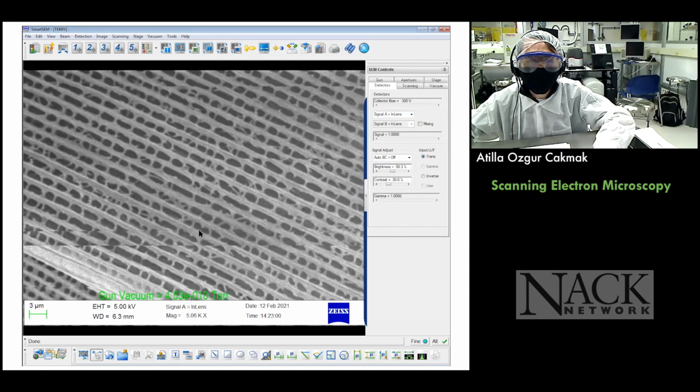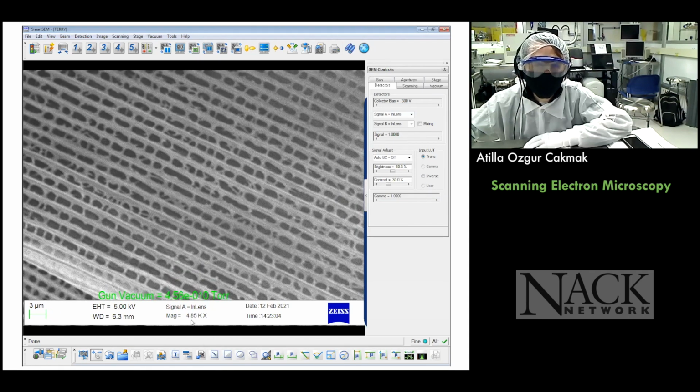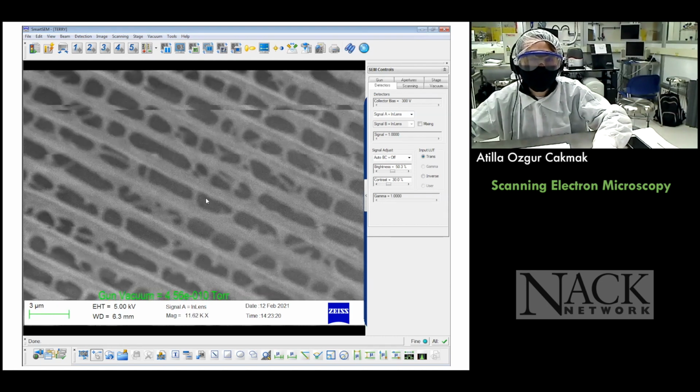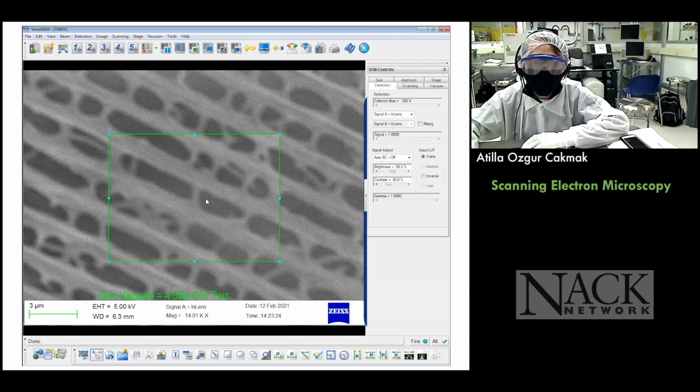All right, so on this butterfly wing, we're zooming in, and what do we see? We're now at 4,800 times magnification. So this is now beyond the optical limit, and we see these kind of optical structures, what we call diffractors. So you see that these are like grating structures that are nicely separated from each other. We can do more focusing on it, like this.